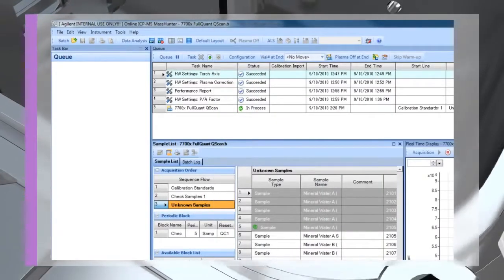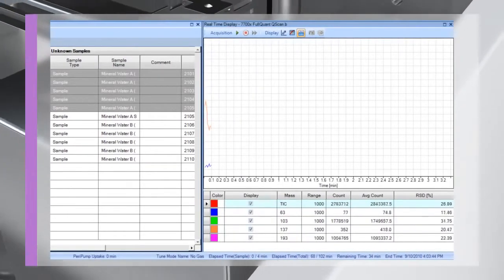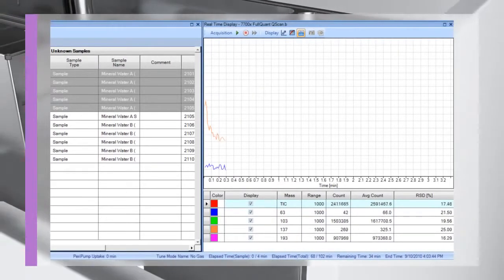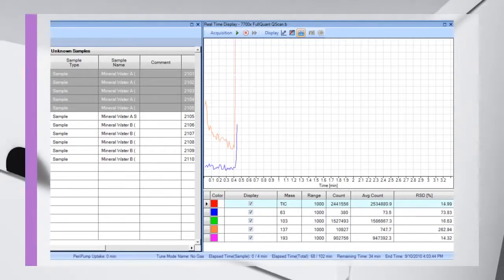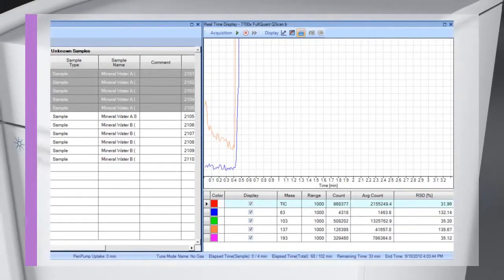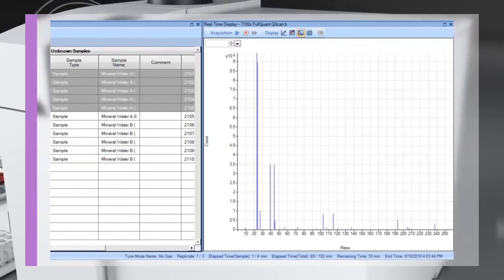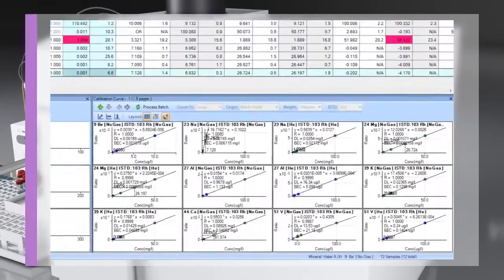Agilent's ICP-MS MassHunter software simplifies routine operation of the 7700 while maintaining the flexibility needed for advanced research. The built-in preset methods, comprehensive auto-tune functions and intuitive graphical interface allow novice users to quickly become productive.